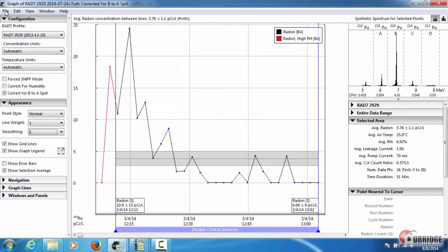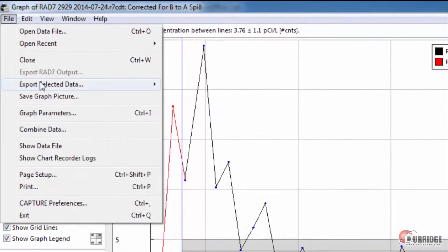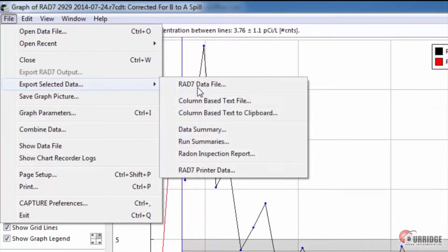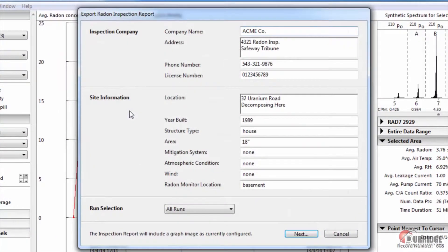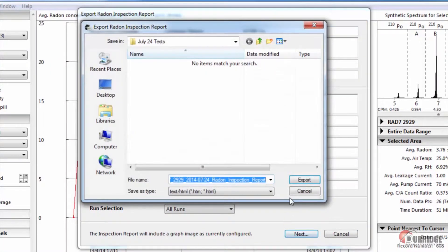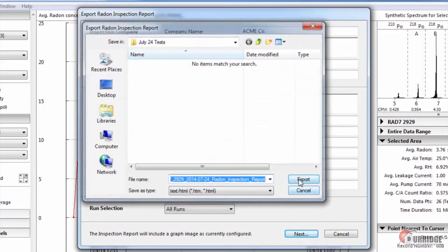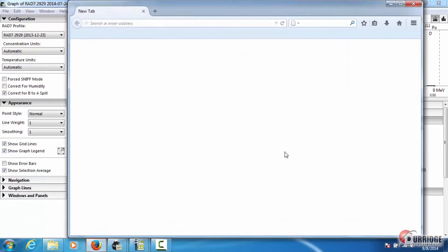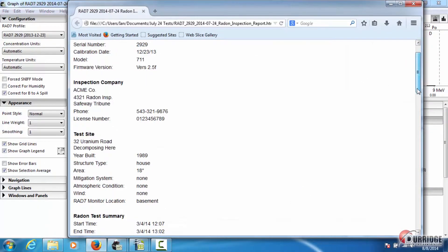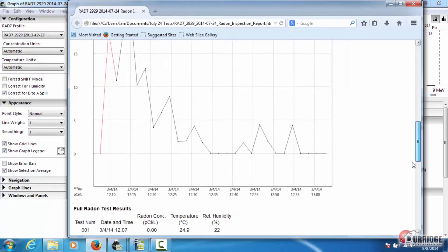Exporting a Radon inspection report saves the data as an official inspection report in HTML. Enter your company and testing information to create a report. When you click Next, choose a location and enter a file name, and then click Export. Then you can view your file in your browser window.